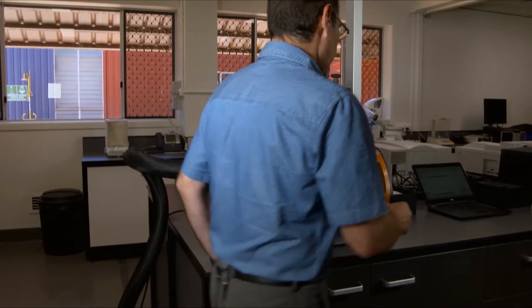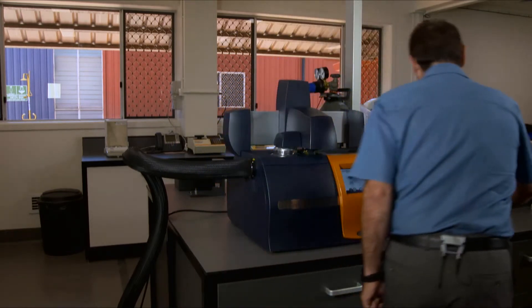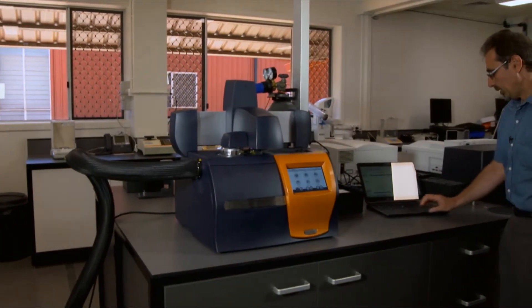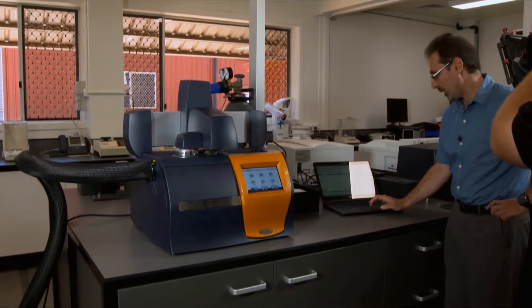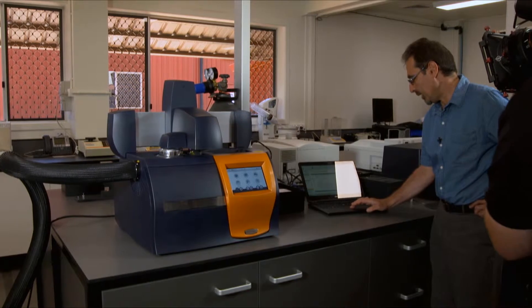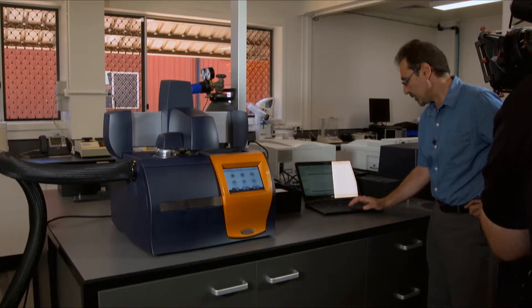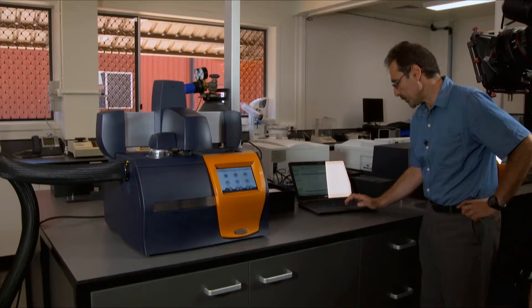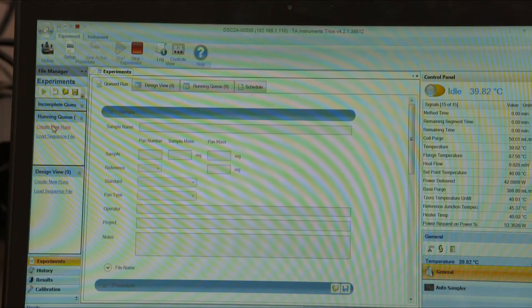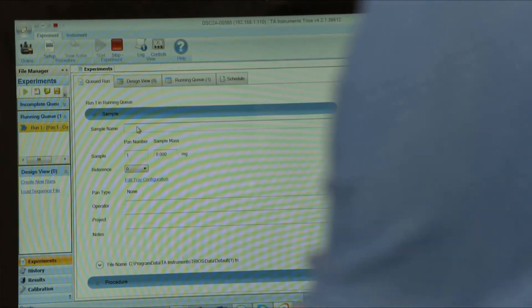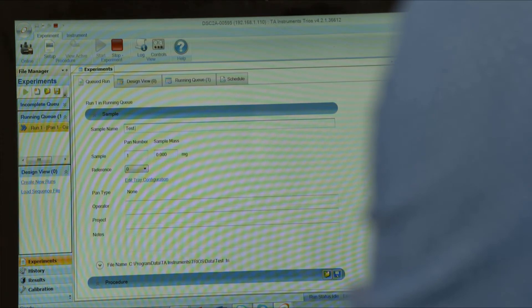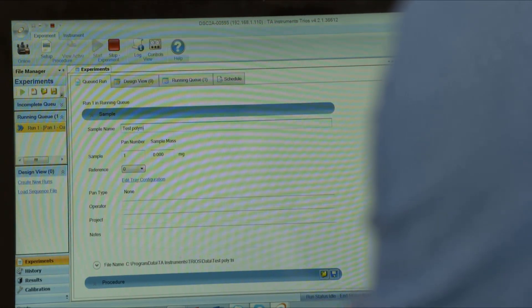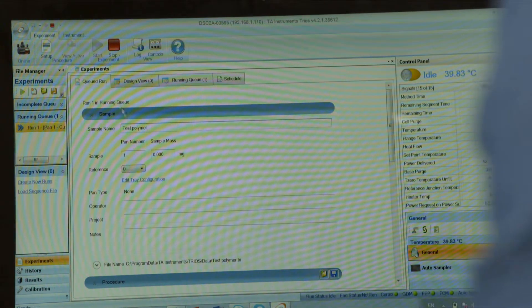To operate the instrument, we will need to use the Trios software. The way to create an experiment is as follows: you click create new run, put sample name, test polymer.